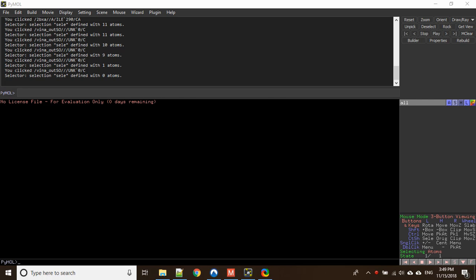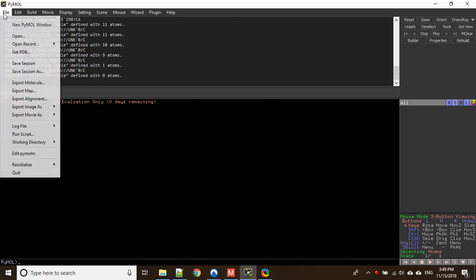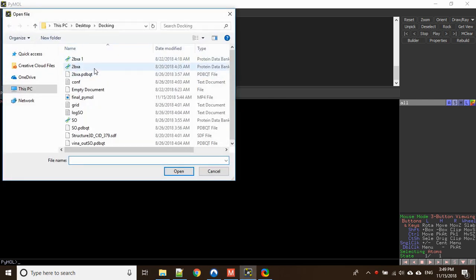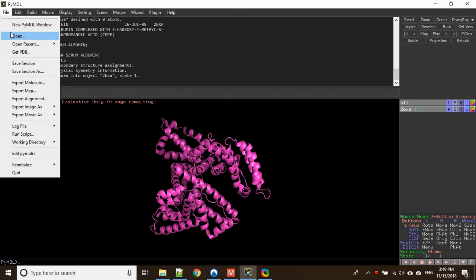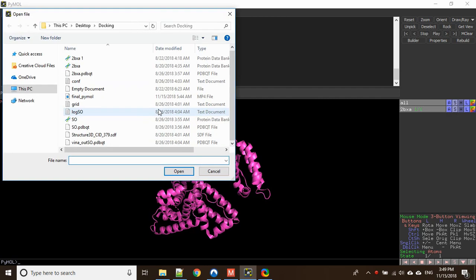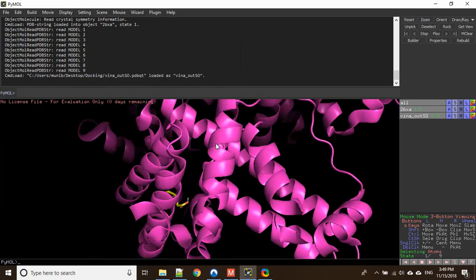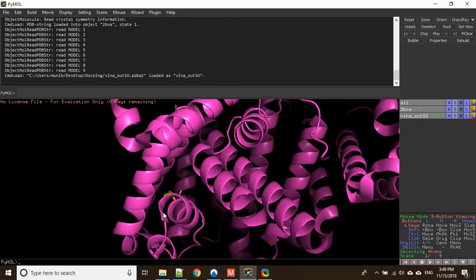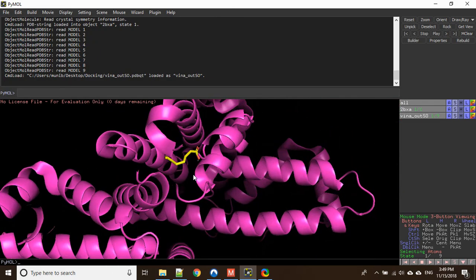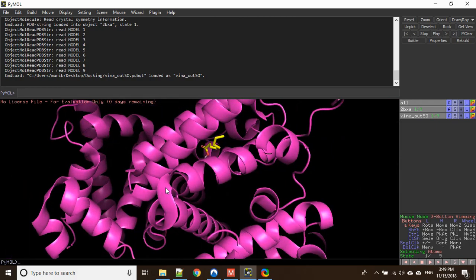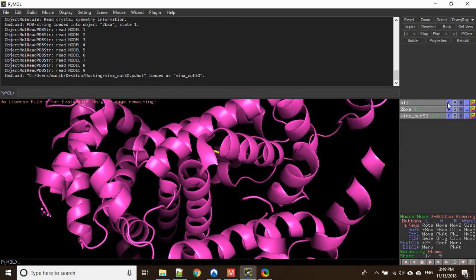So let's get started. Let's open the protein file first — the PDB file, that is 2BXA. Open it, and then open your output file, that is vina_outSO.pdbqt. As you can see clearly, there is one ligand and a protein but it is not showing any interaction or polar bonds.